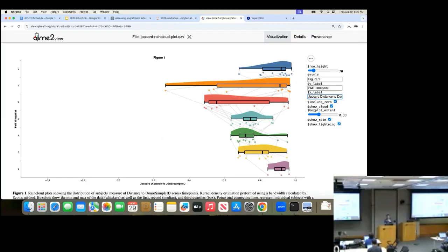Any other questions? Yeah, I have. And I honestly think it's really good. So I tried it with a couple of... all subjects would be represented by the lines and all samples by the dots. And then all time points like this by the cloud and the box plot.